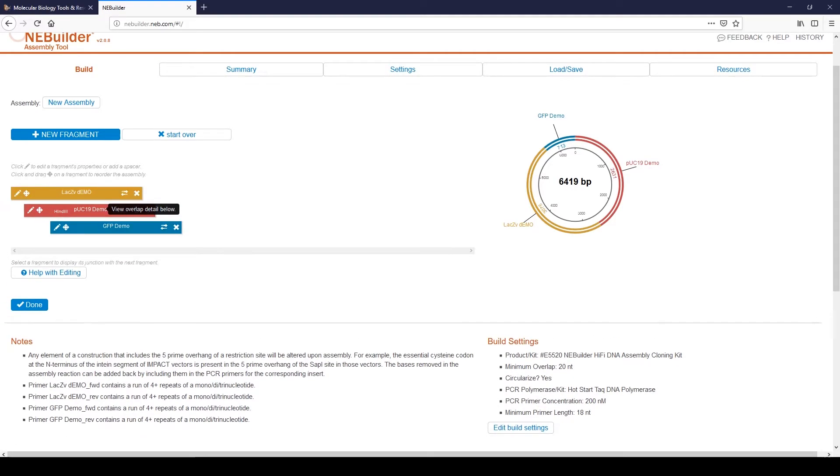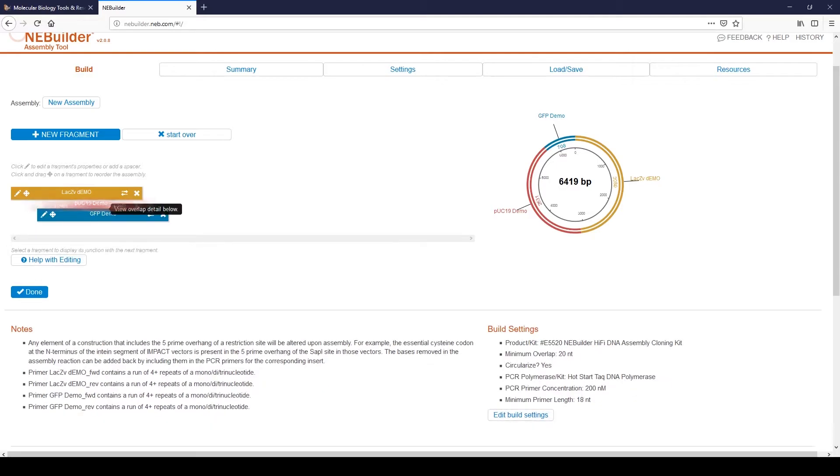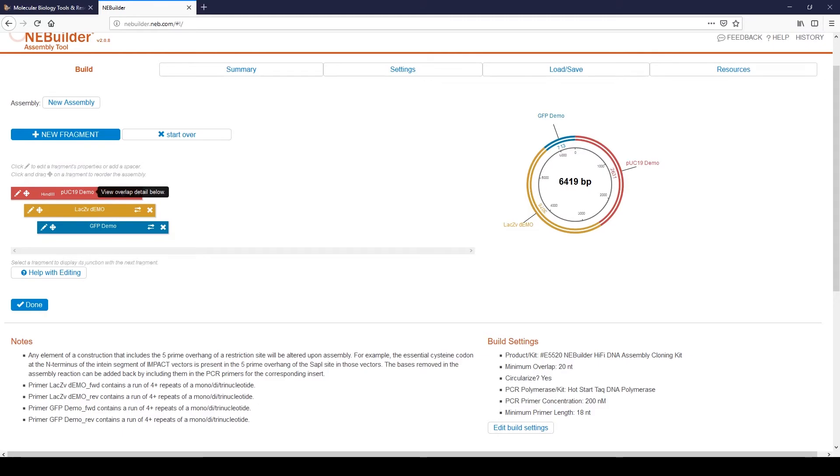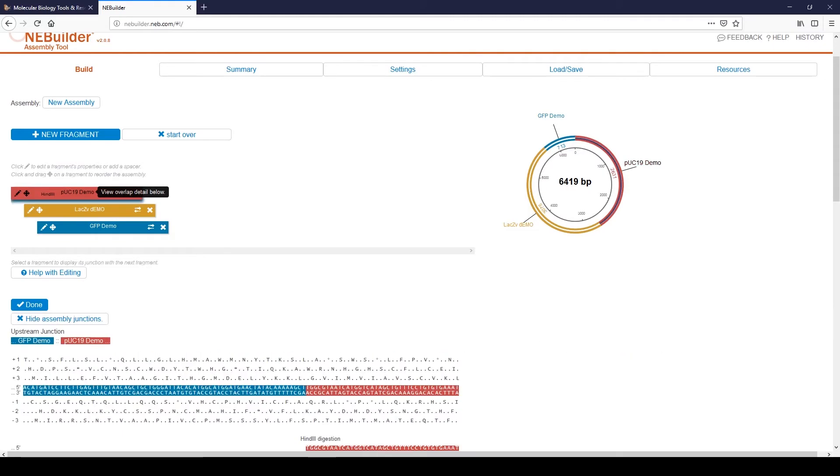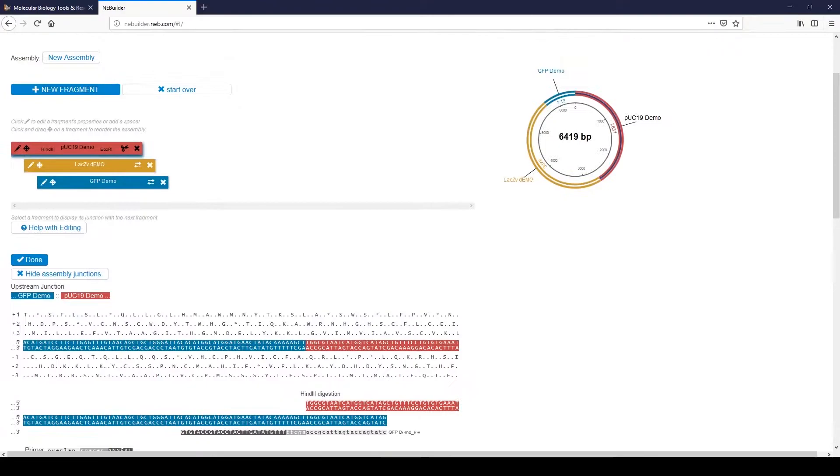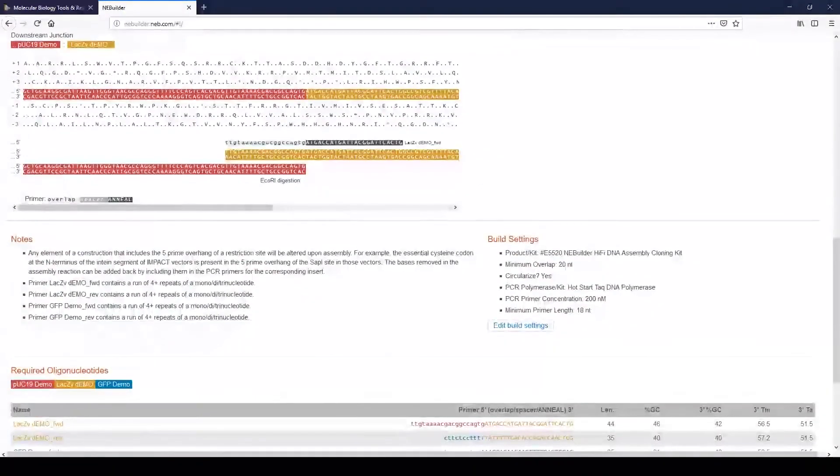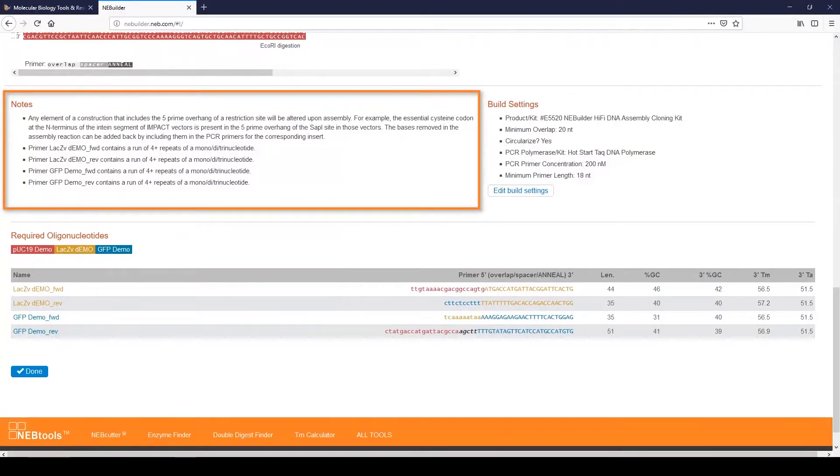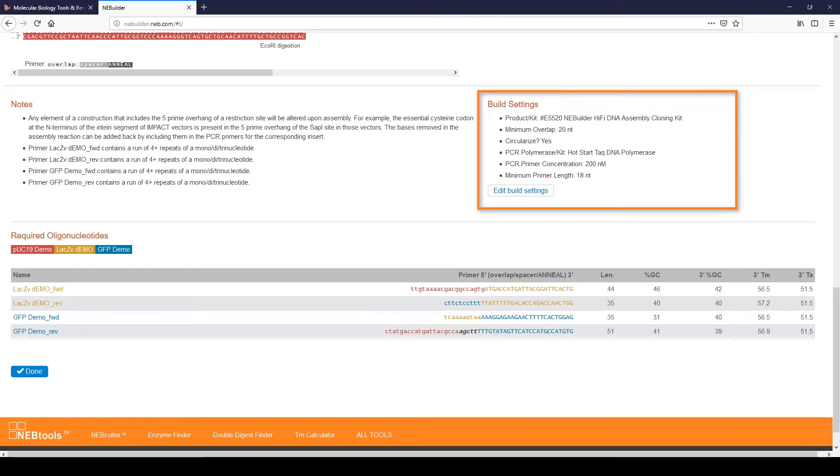Fragments can be rearranged by dragging and dropping the colored bars on the left into the preferred order. You can also delete fragments or edit them by using the functionalities icons shown in the colored bars. Click the bars themselves to view the sequence at the assembly junctions, primer sequences, and the amino acid sequence for all six reading frames. The Notes section provides information about the characteristics of the primers. The Build Settings shows the default settings used to generate the primers. Use this to change the assembly product, minimum overlap size, or polymerase used for PCR.